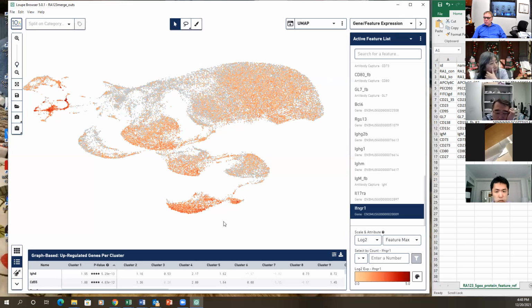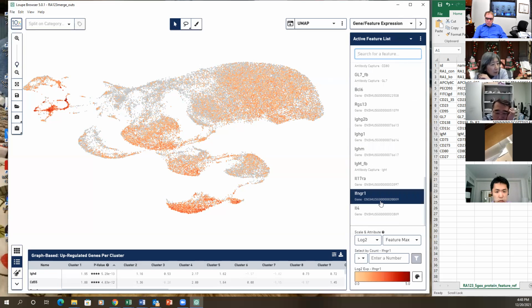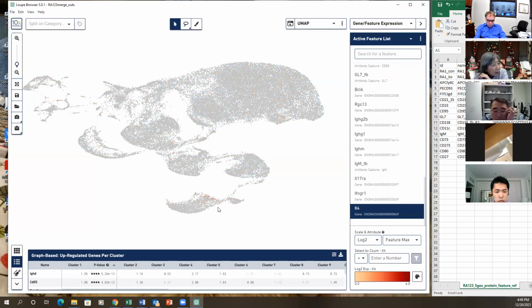So yeah, can you put just IL-4? I think we did it before. IL-4, not a receptor. IL-4, no way. IL-4. Sure, it's up. Yeah, IL-4, first one. Okay, got you. Little bit here in the memory cell, little bit. Even that's surprising. I thought it's completely negative. Maybe some T cells snuck in there. Yeah, maybe CD3.